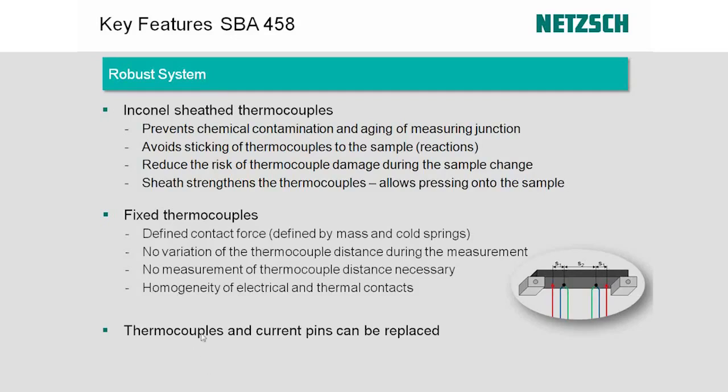And one important feature is that these thermocouples and current pins can be replaced. So if they do get damaged for some reason, it is possible to replace them. So that is important.